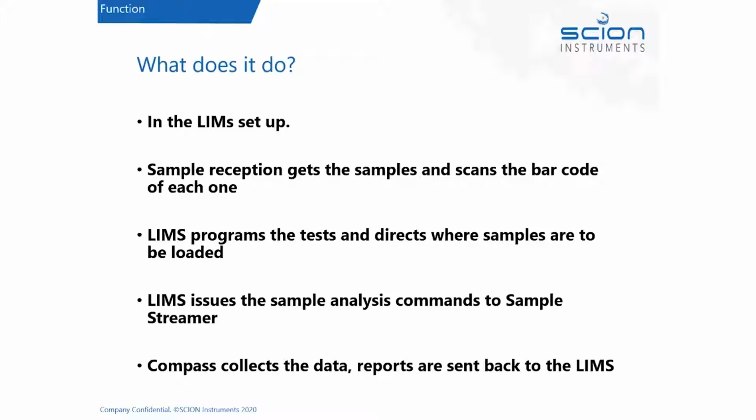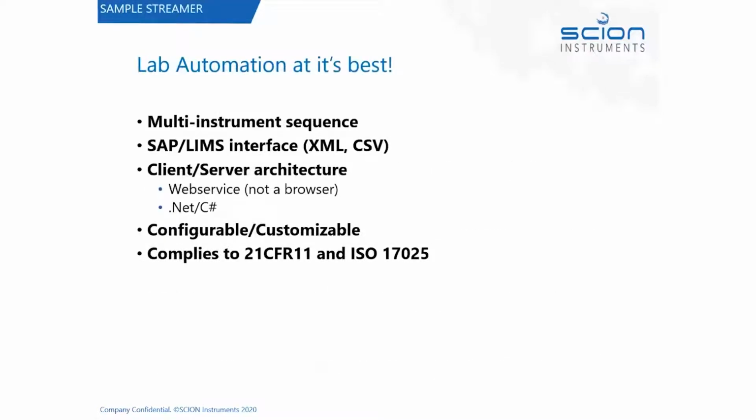When you report it back to the LIMS system, it can be in XML, it can be in CSV, it can be in other formats depending on what you need it to do. So it's a very flexible tool, a very configurable tool to suit many different laboratory situations. It runs in a client-server architecture. It can, of course, run standalone.